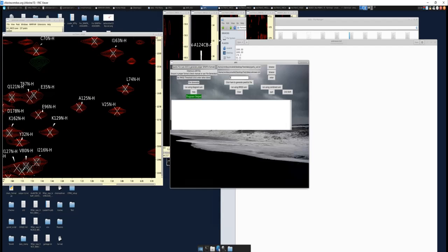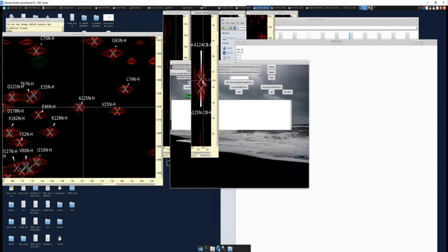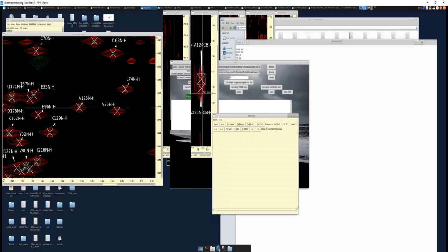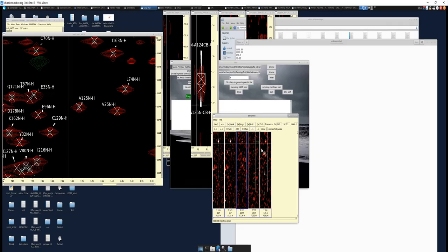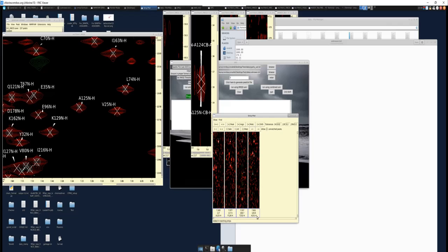So let's say you have a scenario, right? You run a strip plot to determine where the I+1 of this amino acid is, right? You don't have it assigned, you don't know. And when you click your match in your strip plot, let's get rid of this duplicate, you get 3 potential matches. And let's say you don't have any extra info. You don't have your HNCAs, you don't have carbonyls. You can't differentiate it and identify which one of these is actually the I+1.